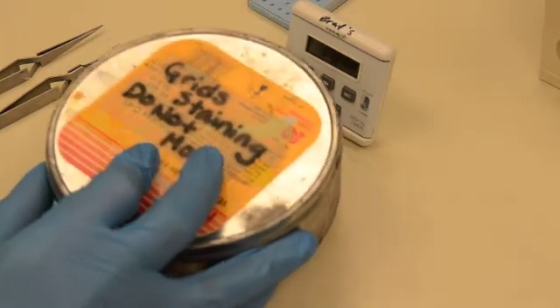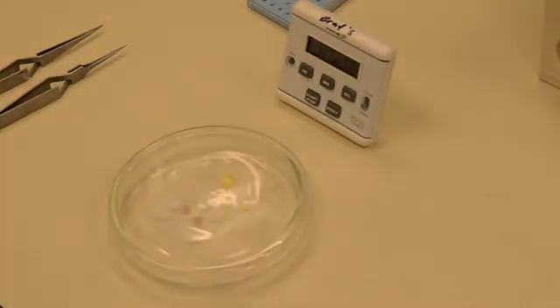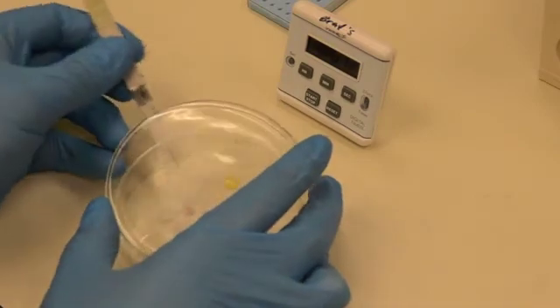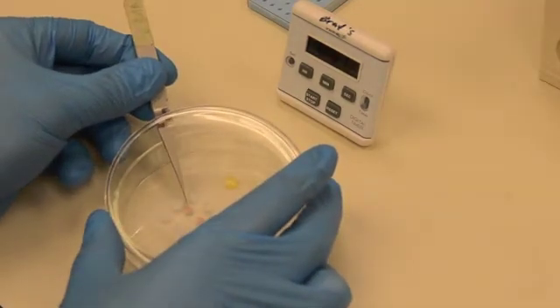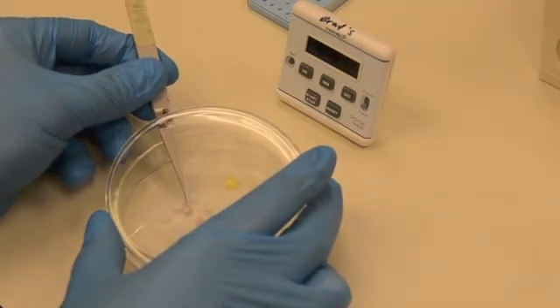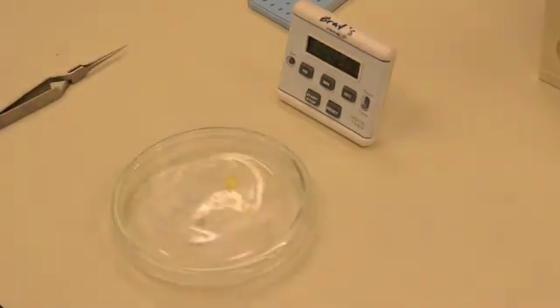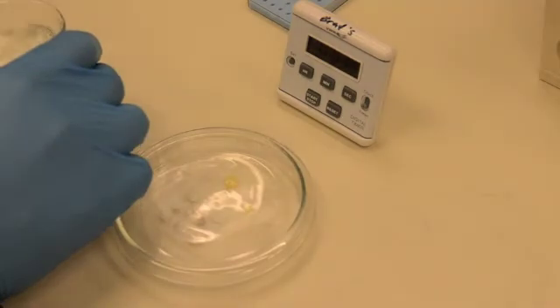Once the end time approaches, get the second wash beaker ready and lift the lid just enough to retrieve the first grid, and quickly place it into the water wash. Wash up and down at least 25 times. After that, set the grid aside.